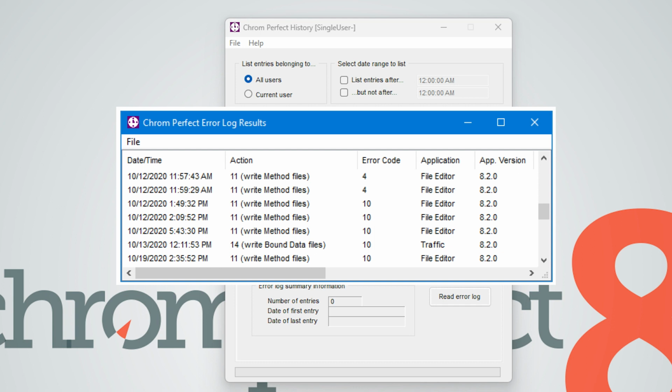Most entries involve a file and list the file name in the file name column. Certain errors supply additional information in the AUX1 and AUX2 columns. Several calibration errors display the component name in the AUX1 column and the level in the AUX2 column. Script file errors display the offending line number in the AUX1 column. Most, but not all, logged errors also appear on the screen. The list does not contain the text of the message that appeared on the screen, but if you double-click on the first column of an entry, then the error message will be regenerated.